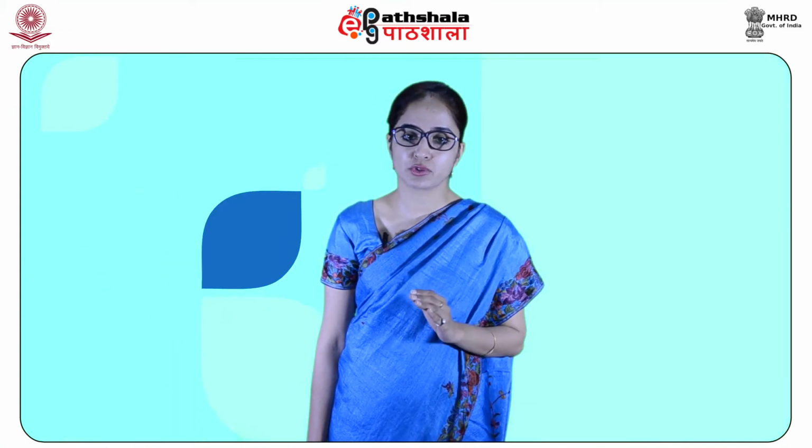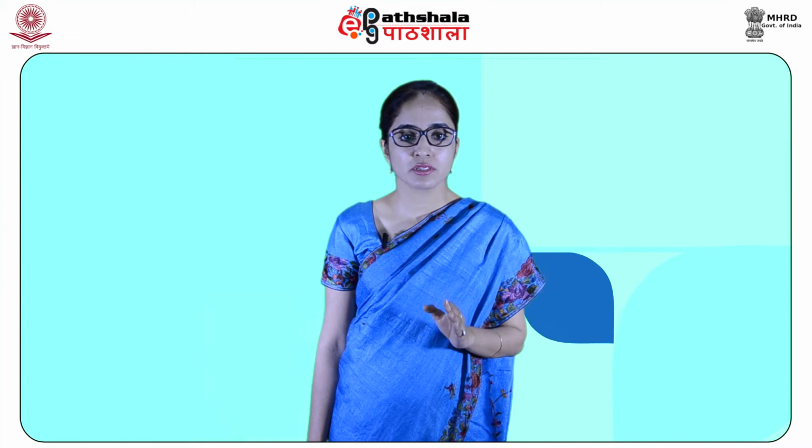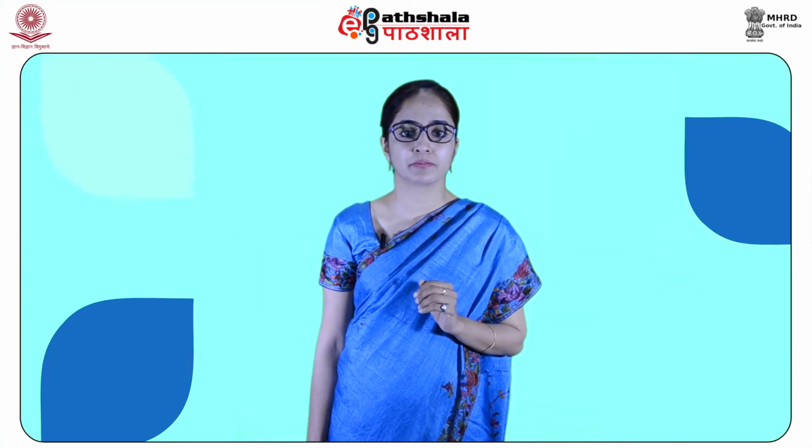to NMR spectroscopy. Because of its favorable nuclear properties and high abundance, 19F NMR spectroscopy is highly sensitive and fast as compared to proton NMR spectroscopy. Indeed, the 19F nucleus is the second most receptive NMR nucleus after proton nucleus.